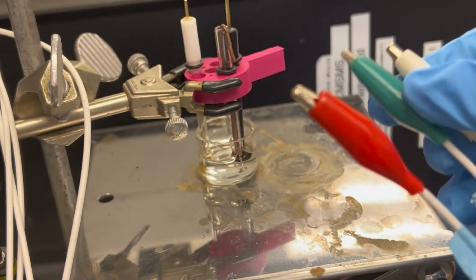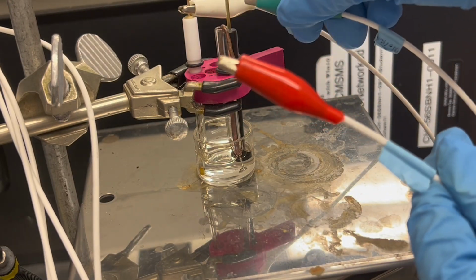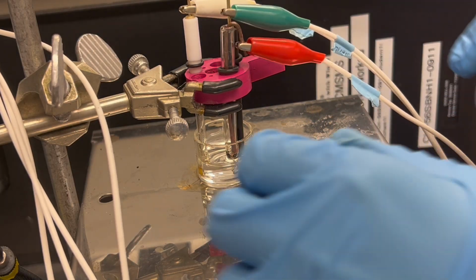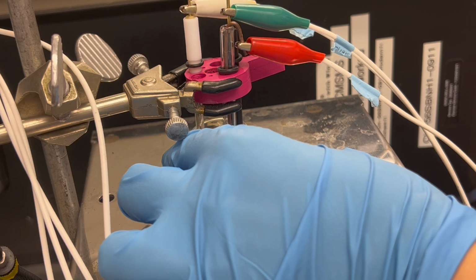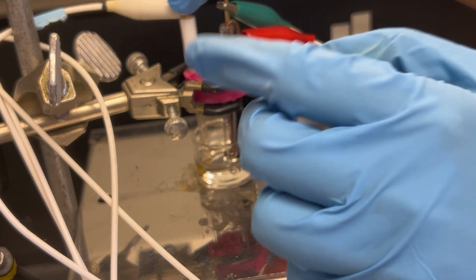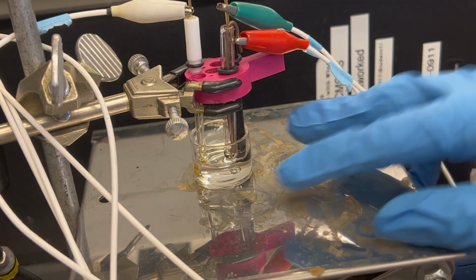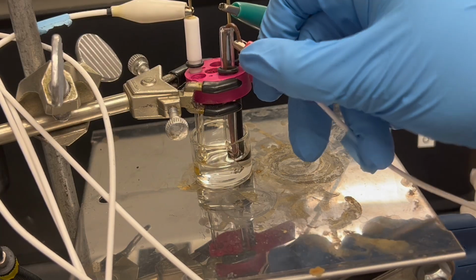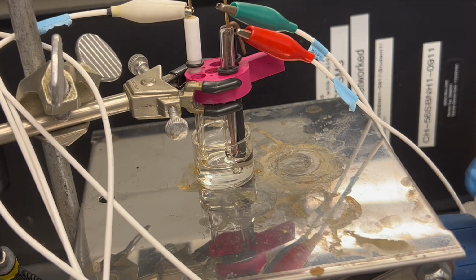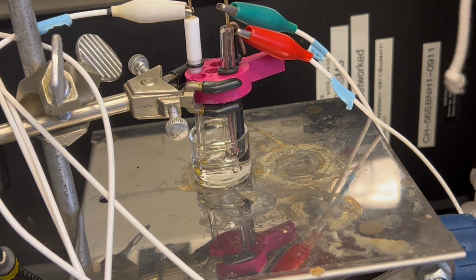The last step for our setup is to connect the wire with the electrodes. We usually connect the reference first, and there's no preference or requirement for which of the working or counter electrode to connect first, but maybe always connect the reference electrode first. And we should make sure it does not touch the bottom or the edge or another electrode, and make sure they connect well.